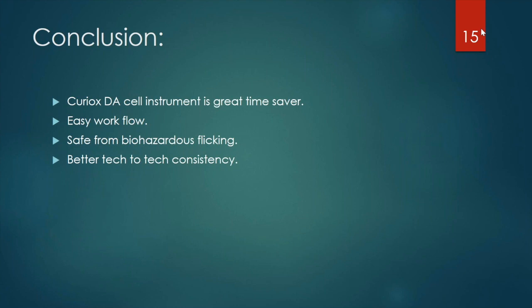I did not see any cross-contamination. You should still be careful while transferring your plate into the incubator, bringing it out, and putting it into the washer. Not because they would cross-contaminate. It never happened that one droplet went into another droplet, because they're still separated on the plate. If you see there's a crevice, these drops do not wander around. My only concern always had been not to disturb my sedimented cells, because you want them to settle down. If you shake them too hard and then put it in the washer, you are going to have your cells aspirated out and you will have a very low cell count.